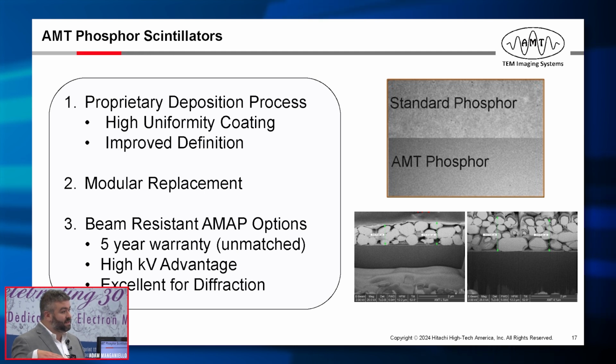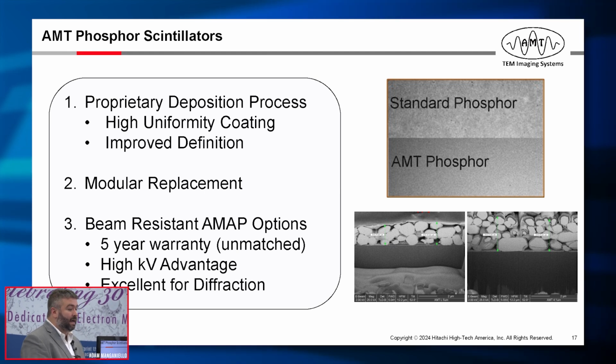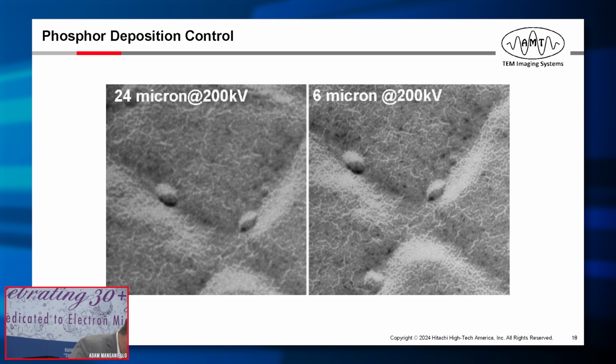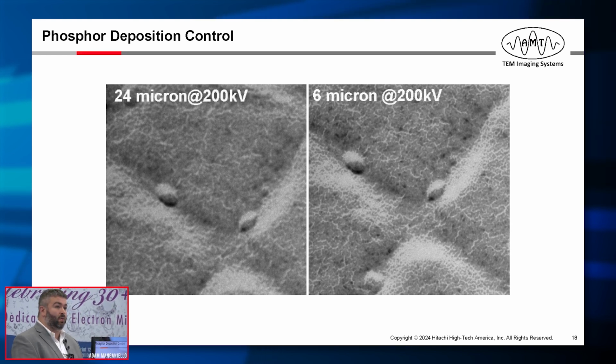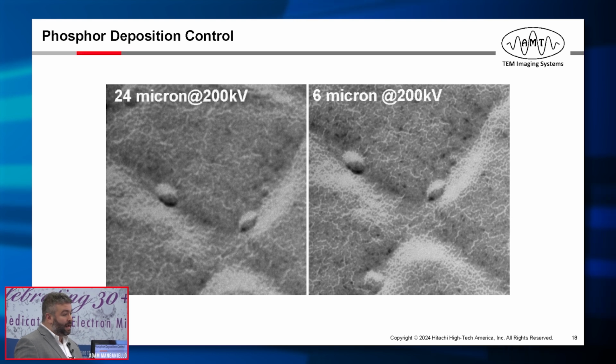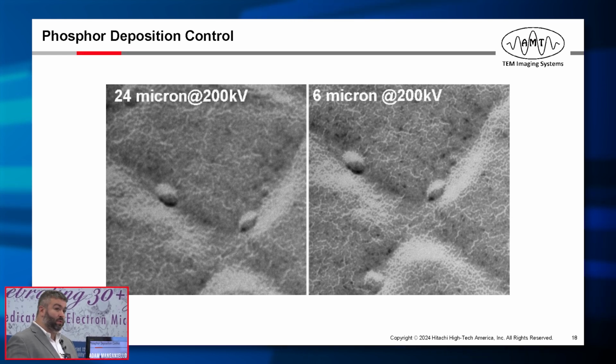But when pixel densities on the sensor side went down, below 7 microns to 6, and now you're at 3 and 2.8, there's an intersection of data transfer where if your phosphoscintillator is really thick, and I'll show that in the next slide, you get blurring. And so the next piece of this, I'll segue into lenses, is that we do our best to make as much light as we can at the source of this optical system, and then try and preserve it as much as we can going down to the sensor.